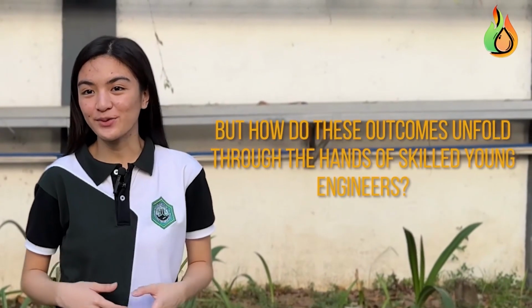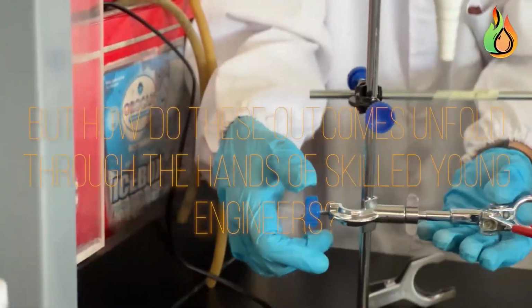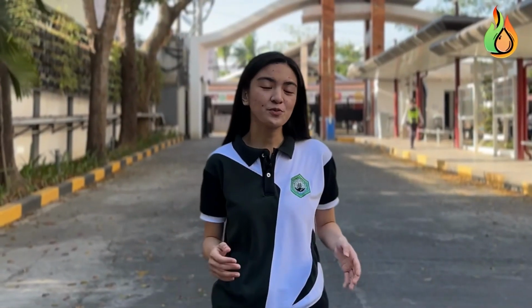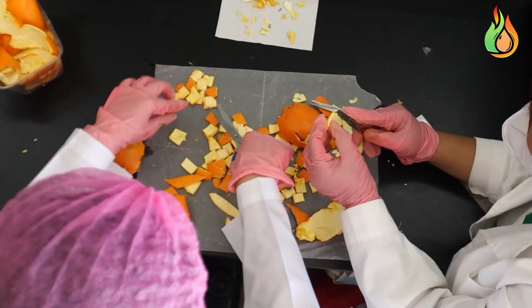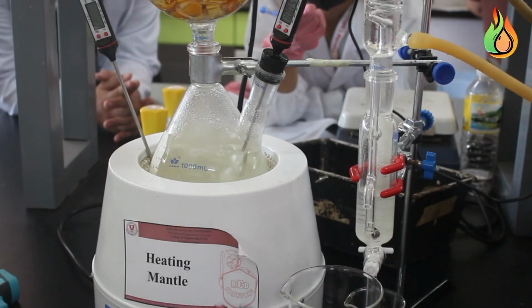But how do these outcomes unfold through the hands of skilled young engineers? Let us step into the lab and witness this process come to life. From setup to preparation, every step showcases precision, efficiency, and technique, one crucial stage at a time.